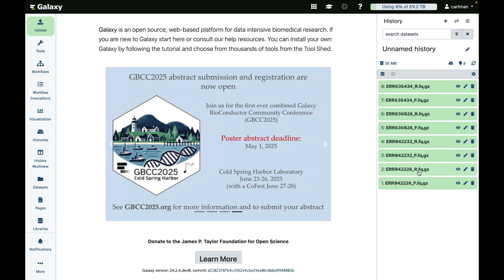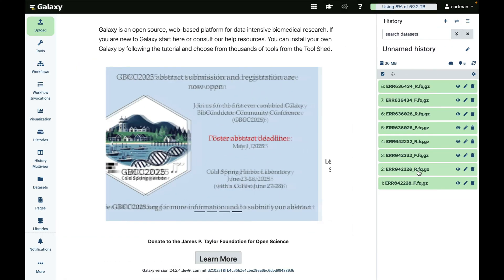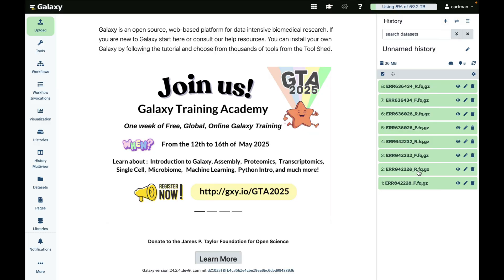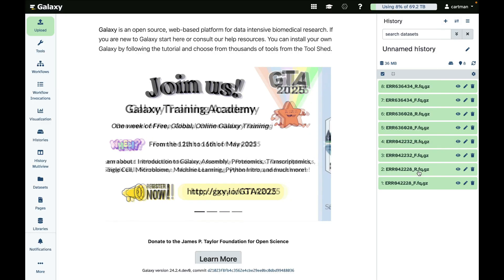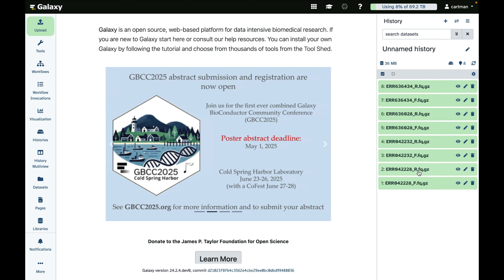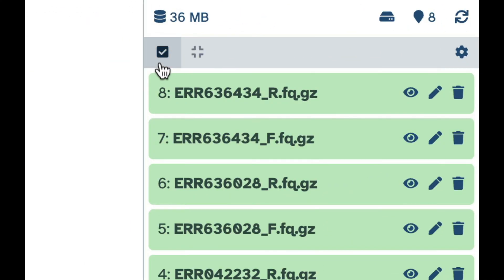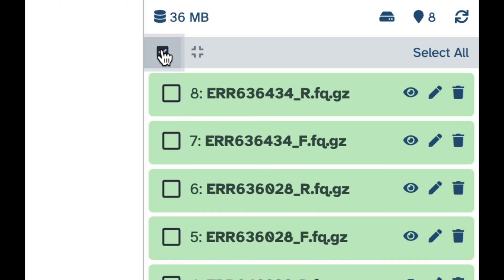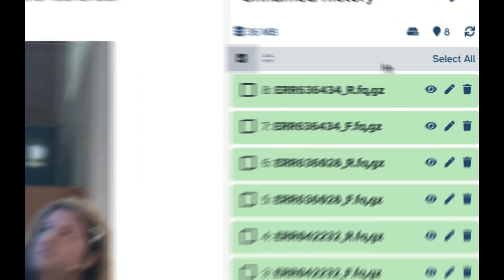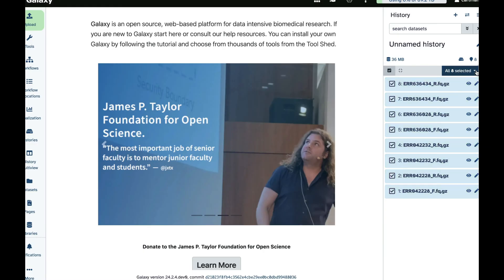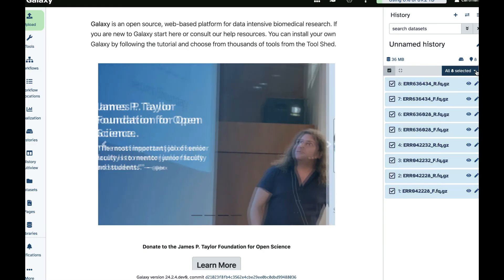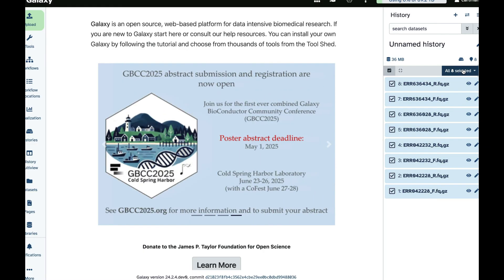And when we analyze things like this, we usually want to do the same thing to all of them. So instead of doing this one by one, we can combine them into something that in the Galaxy world we call collections. Let's do that. So you click on this button, you select all data sets in this case.